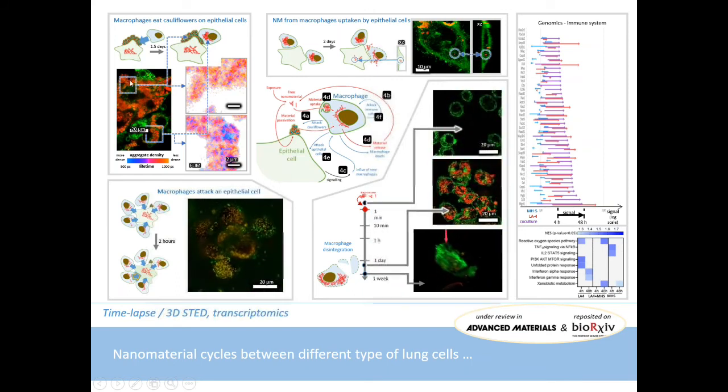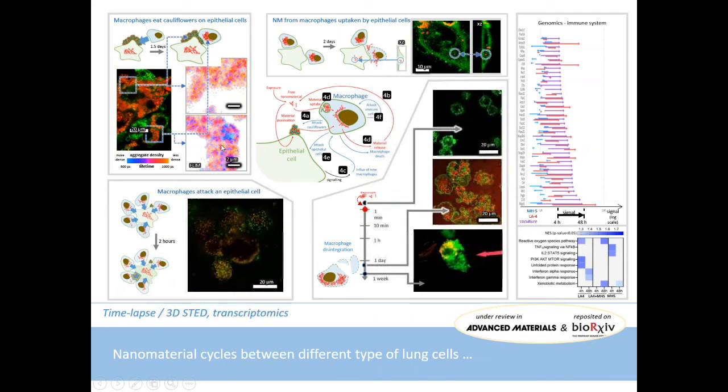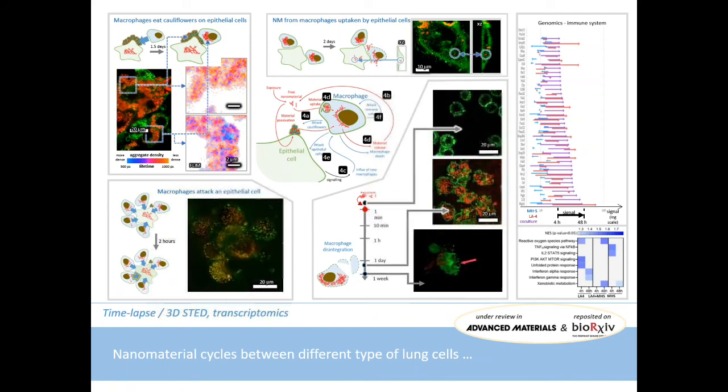For example, here on this image, this is the structure still on the epithelial cell. The lifetime is longer, so it means that the probes are more apart, while after fresh macrophages uptake those structures, the lifetime decreases, meaning that the probes are much closer to each other. So it means that macrophages degrade organic matter, but then are not able to degrade anything else, so they die.